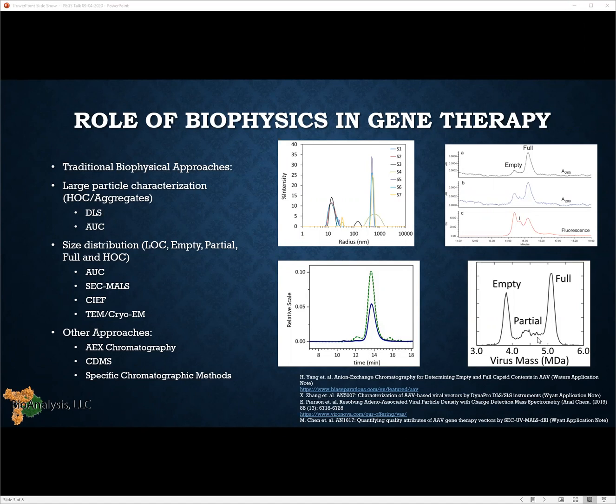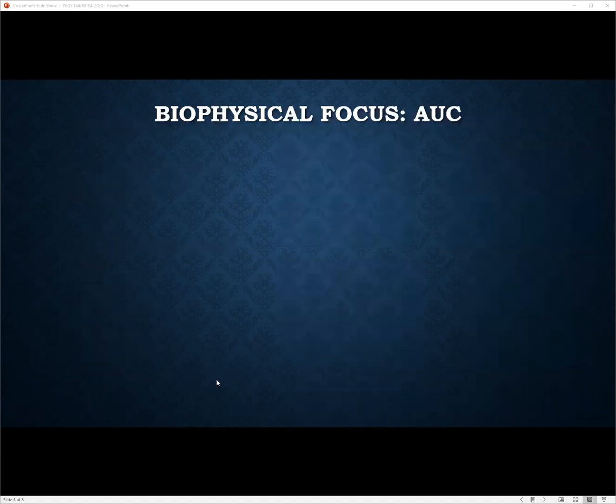But again, this is limited in these particular regions; higher order capsids, reversibility, and so forth are going to be very difficult to attain. Other specific chromatographic methods, like BIA Separations with their special columns, can also give you some good relative information, but again suffer from some limitations.